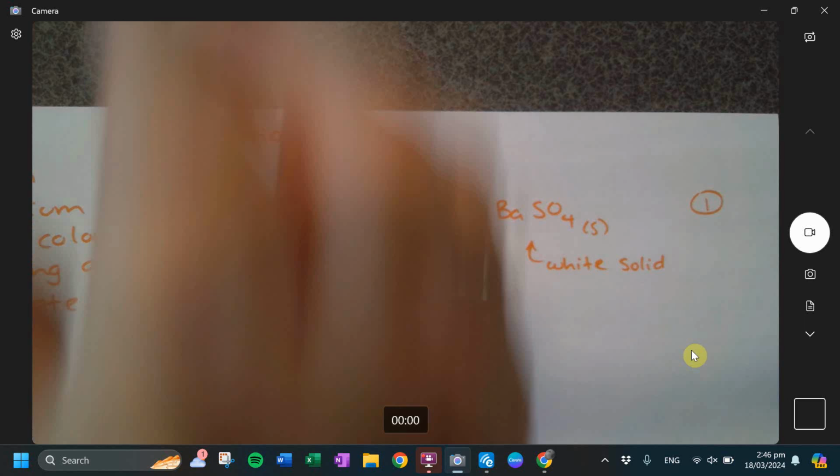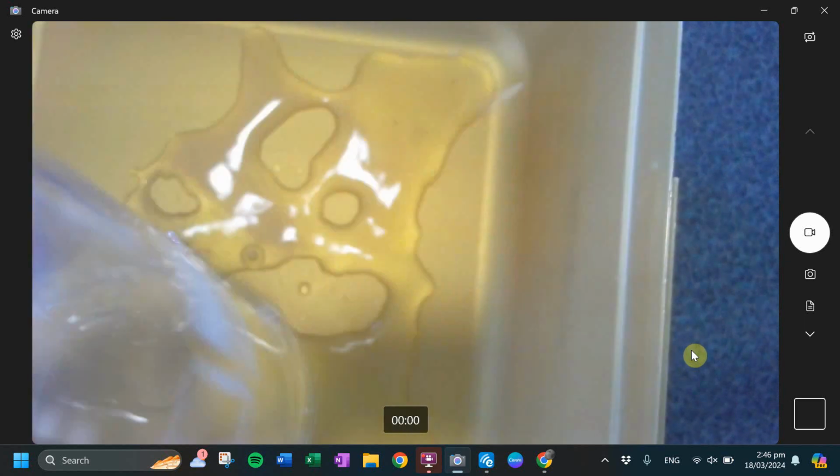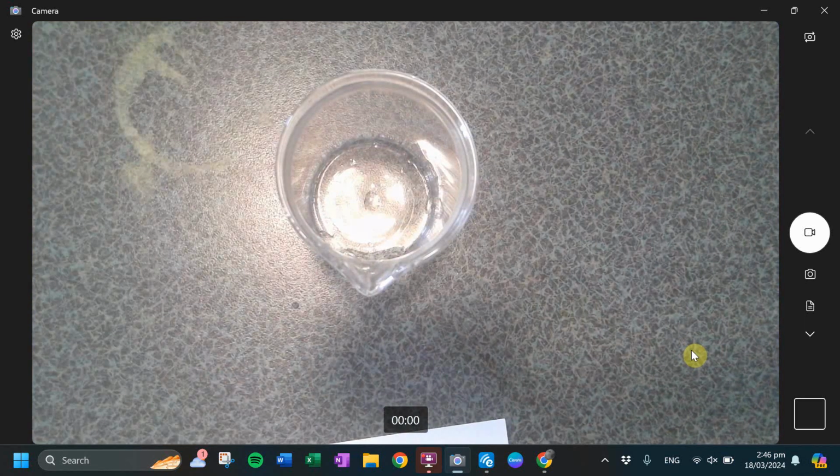All right. When I'm now done with this reaction, I can then pour it into my waste beaker and use a little bit of the distilled water to rinse it out. That way it saves us a trip to the sink. We can just do one big trip to the sink at the end. And then we do the next reaction. We're all ready to go.